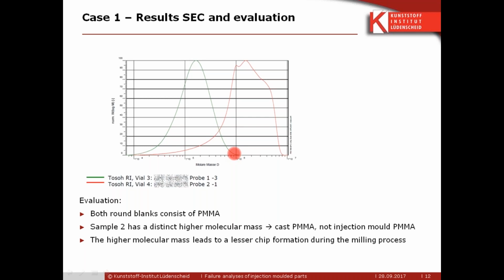But the listener is asking again if you can quantify the molecular weight automatically through the instrument software. Yeah, we see the numbers. We are often working with a relative molecular mass. You do a calibration right before the measurement.